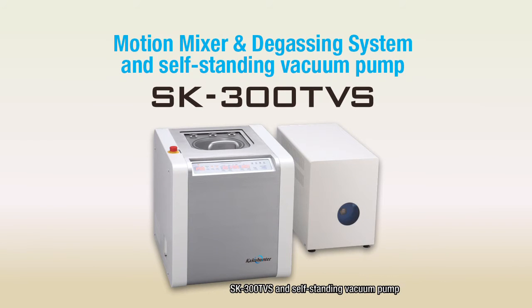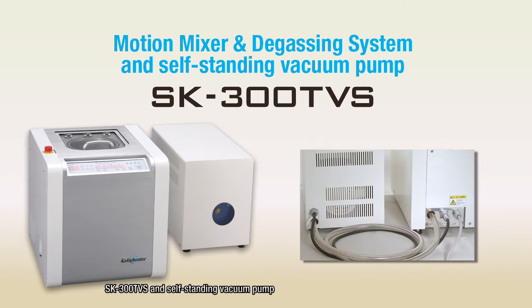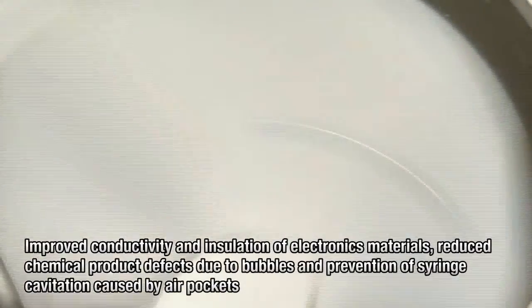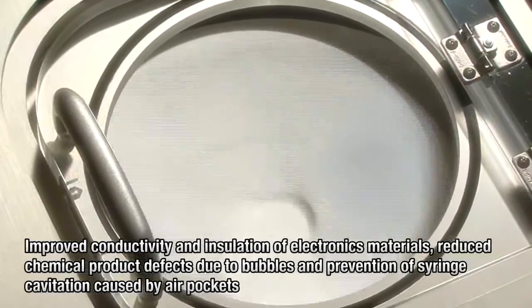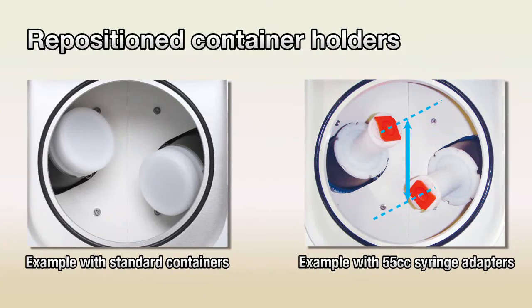Next, we will explain the depressurizing feature of the SK300TVS with vacuum pump. The SK300TVS adds depressurization to mixing and degassing by revolution and rotation to remove microscopic bubbles. This feature can be used to improve conductivity and insulation of electronics materials, reduce chemical product defects caused by bubbles, and prevent syringe cavitation caused by air pockets. Moreover, mixing performance has been enhanced over earlier models by repositioning the container holders along the rotating axes so that the material contacts a larger surface area of the container.